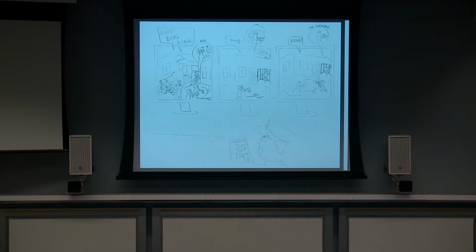All right. So, as you can see up here, there are 3 different computer screens, and on them there are 3 different images which represent the various sizes of silver. So, on the far left, we have the nano-sized silver because, well, this type of silver actually causes the most damage on the cells, as you can see, like all the cracks. And in the middle, we have the bulk silver because it causes the least amount of damage. And on the far right, we have the silver ions, which cause like a medium level of damage.